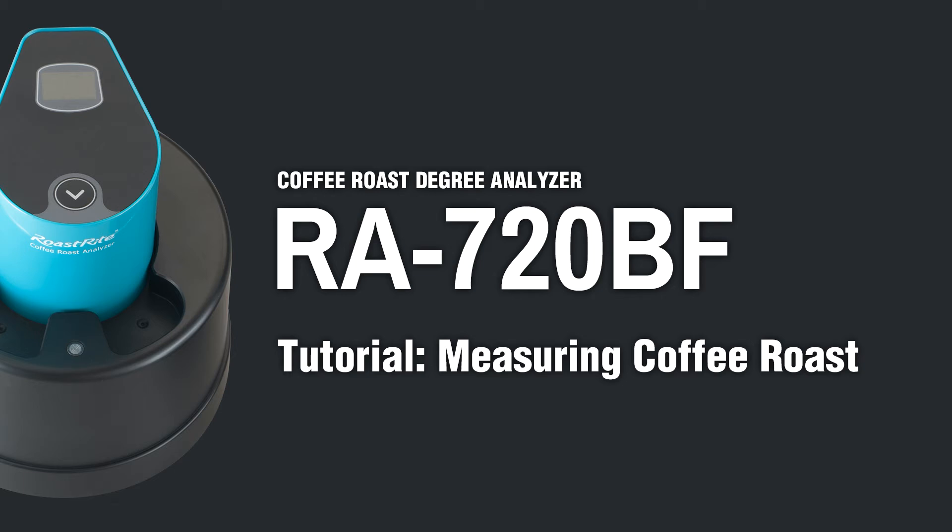Hello and welcome to Roast Right Tutorial. In this video, we will show you how to operate the Roast Right Coffee Roast Analyzer for accurate results.